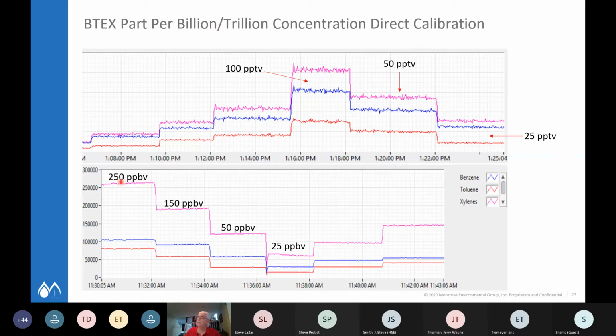So here with the funnel off mode, which I'll talk about briefly, these are the different concentrations, so you can see the responses on the side. This is about 25 parts per billion here. When we decide we really need to look low and really want to push our detection limits, then we turn the funnel mode on, which is the PTR in turbo, basically. It's a much more intense focusing of the ion path, so you're really brightly focusing.